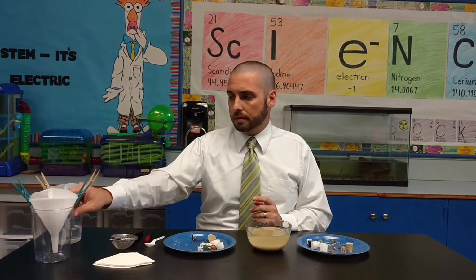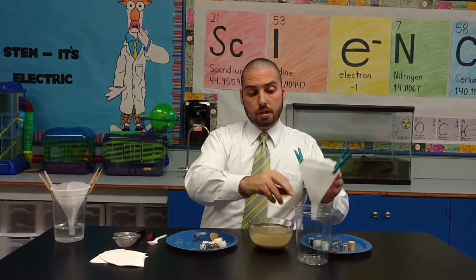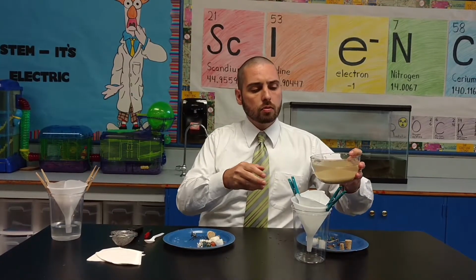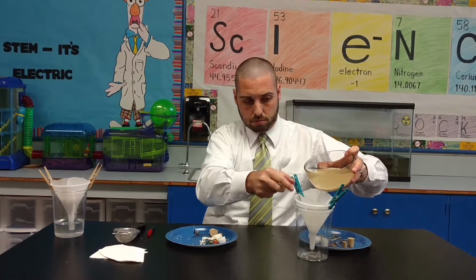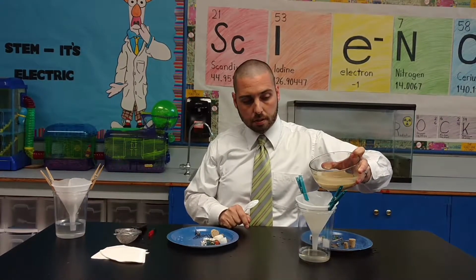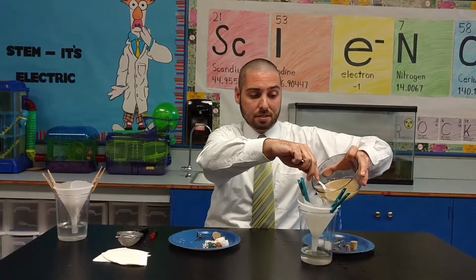Well, hopefully, maybe, if you expose them to filter paper and funnels, they might be able to direct you in that direction. So you can tell them to go ahead and take their funnel and take their filter paper and pour that water as well as the sand. Woo, making a little bit of a mess here. Into the filter paper. And messes are going to happen, and I tell my kids that all the time. It's okay if we make a mess. It's going to happen.